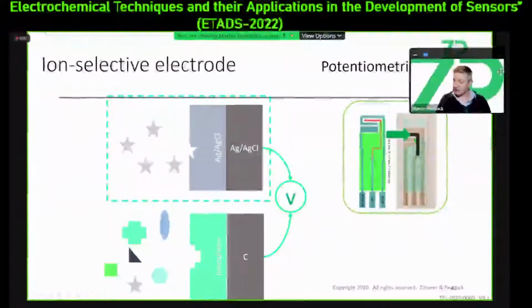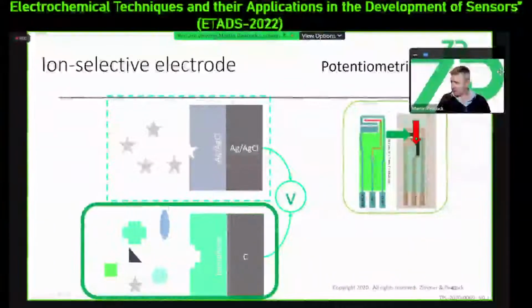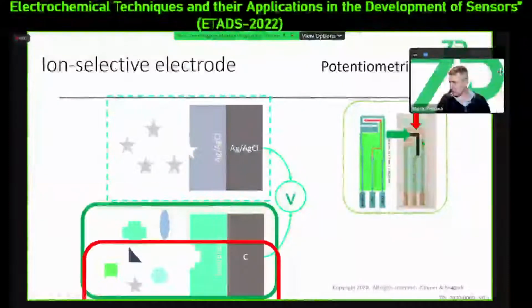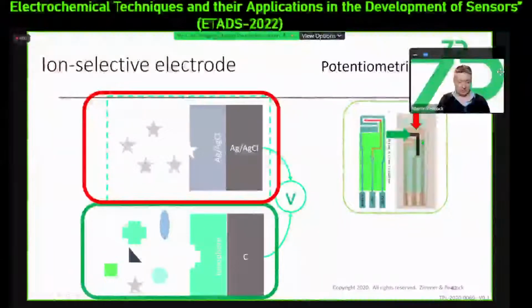We've been using the same one throughout, except in the experiment that Andre and Solron are about to do, they'll be using a working electrode that is pH sensitive. And then they will be using another of the electrodes on board, which is silver chloride, as their reference electrode.